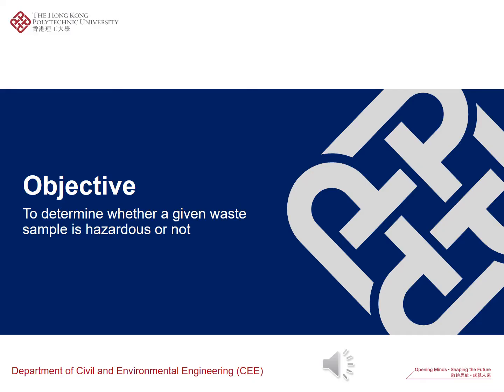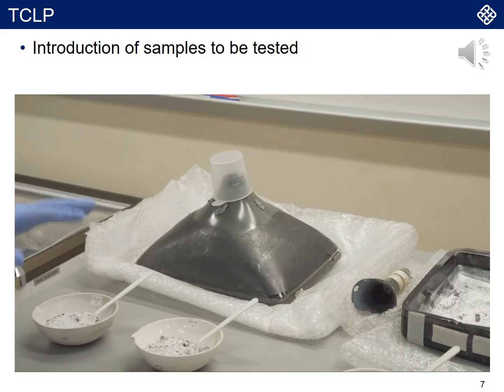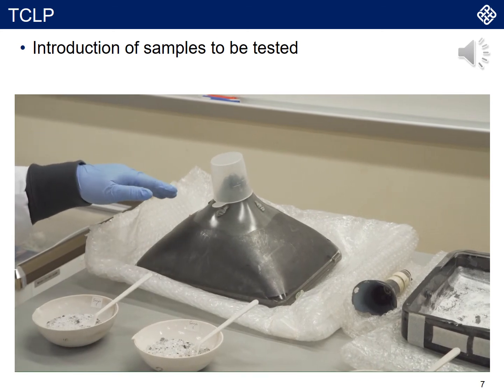Thank you. The major component of this experiment is to clarify whether our solid waste still contains heavy metal after the TCLP treatment. Meanwhile, a lot more details have been provided in the handouts. Please have a look. This is the material that we are going to test.